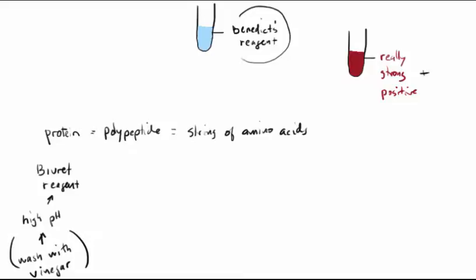So Biuret reagent is this blue stuff. Similar to what we did before, you would add it to a substance. If your substance is here, that's your question mark. You would add a quantity of Biuret reagent. You would mix it all up so it's going to be uniform in color, and at that point, it'll either turn color or it won't. And the reaction that occurs here is actually a reaction that involves a peptide bond, which is the bond that occurs between amino acids.